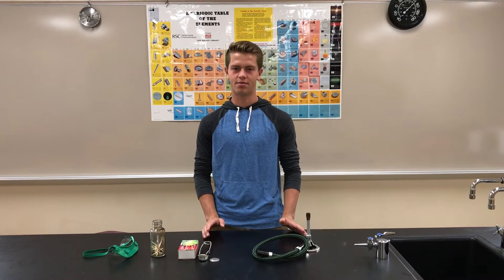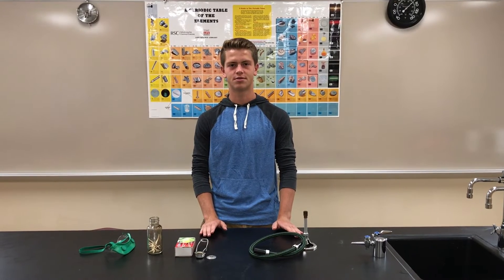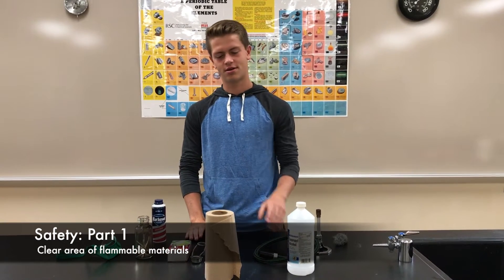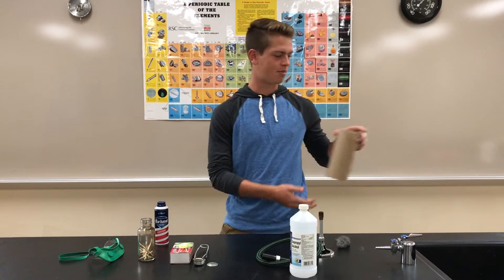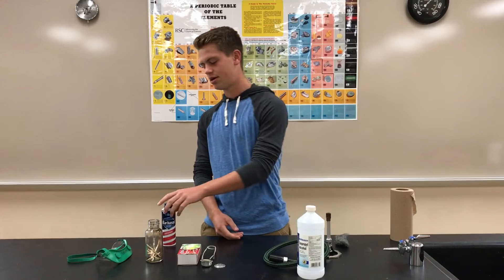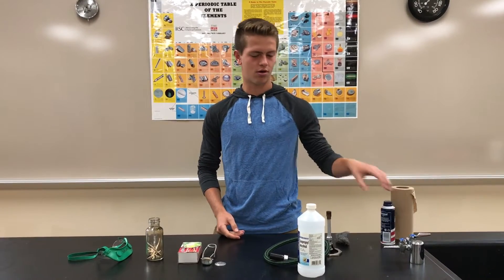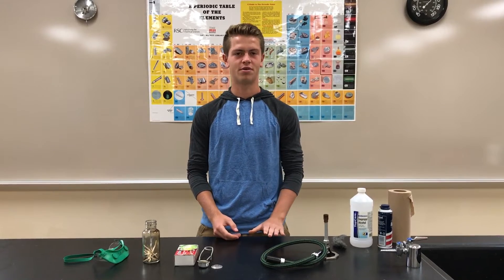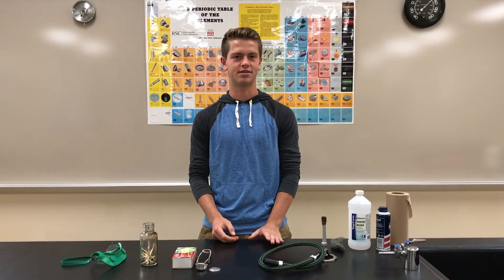Working with any flame can be dangerous, so I'll start by going over safety rules. Step 1: clear the area of all flammable objects. This roll of paper towel is obviously flammable, as is steel wool, an aerosol, or any alcohol. You'll want to keep these far away from the flame so that there's no chance they could ignite spontaneously.